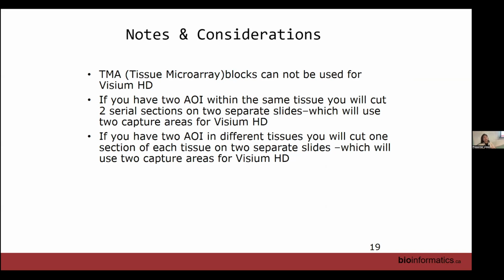So then we will prep the whole entire thing, or just say Visium or 10x Genomics. Most people will know that in the majority of labs. I don't know if diagnostic labs would know that, but the research labs may, like where I'm working now at Mount Sinai, they know that, as well as another core facility here, which is called Pathology Research Program. They will know that. So you put that on it and people will know.